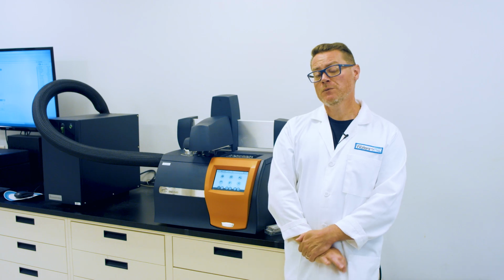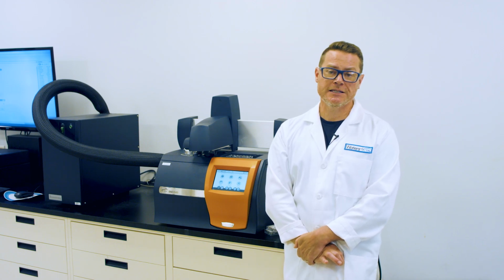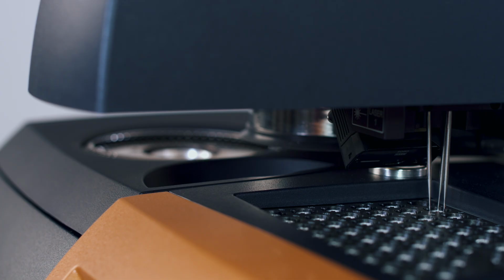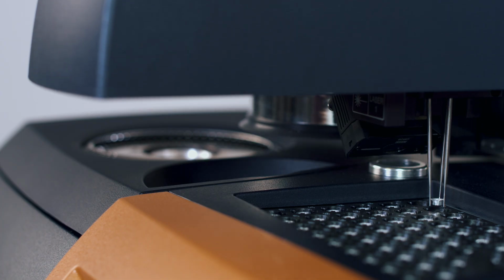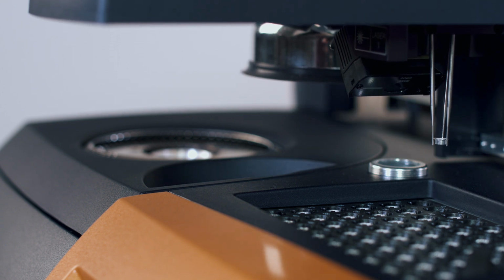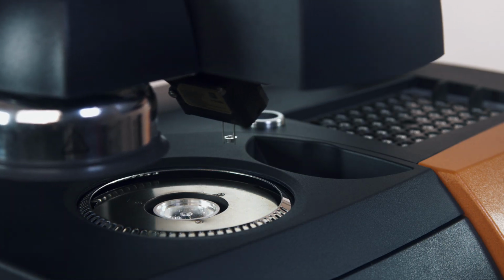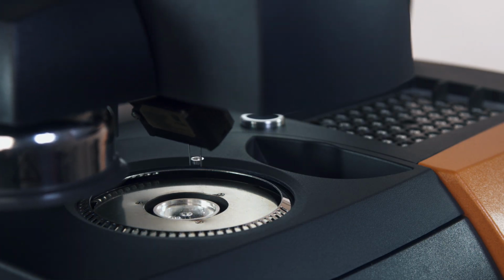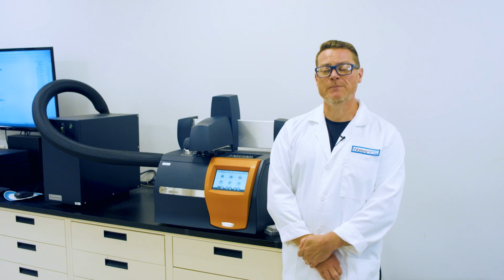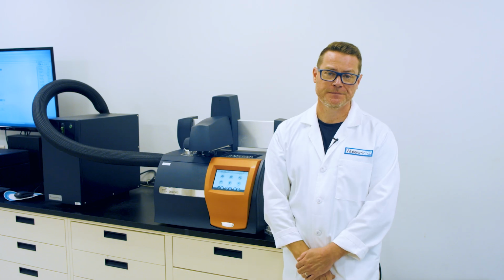The instrument will apply power through the furnace to the sample and reference, and the temperatures of both will start to rise. If the sample is very boring, undergoes no phase changes upon heating, and has the same heat capacity as the reference, then both it and the reference will increase in temperature at the same rate, and no difference in power will be measured. You would see a baseline centered at 0 on the y-axis.